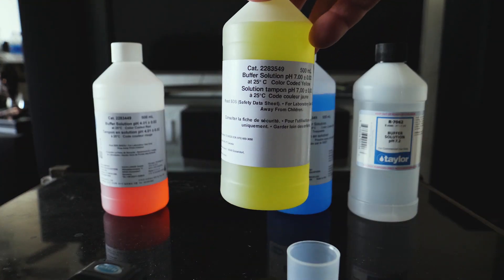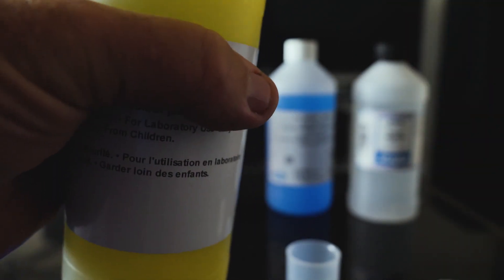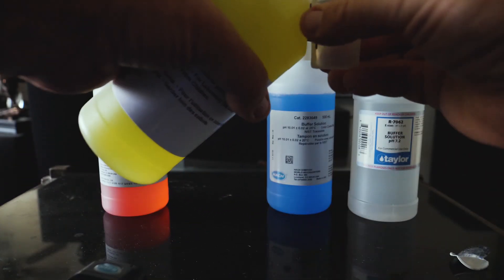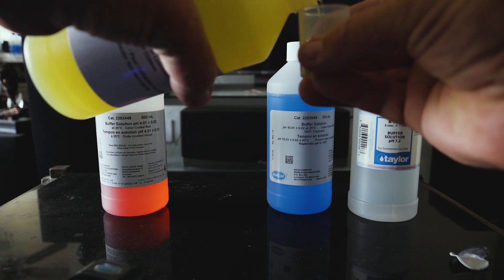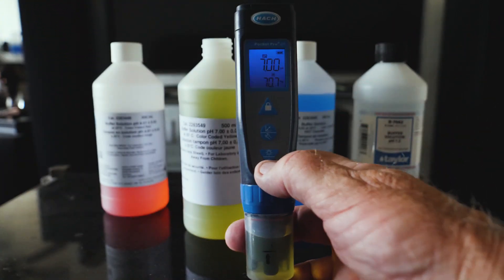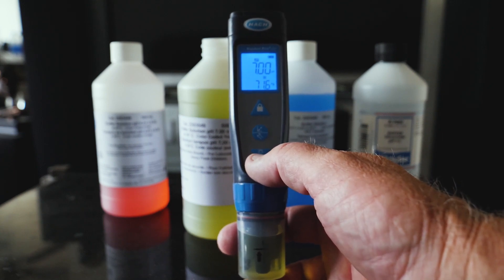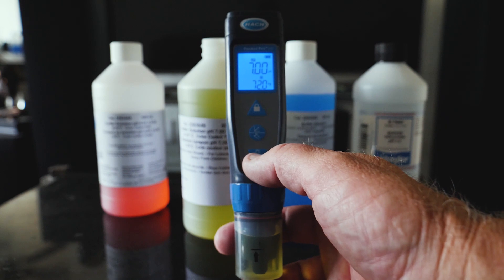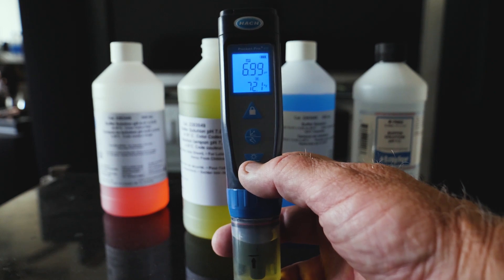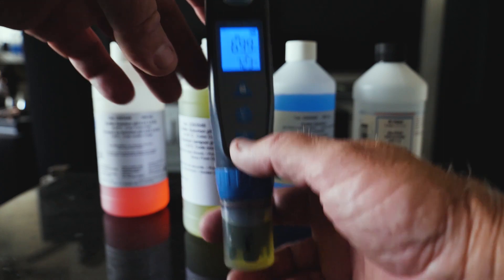Next, the 7.0 solution. Let's see what we got. 6.99, 7.0. That's extremely accurate.